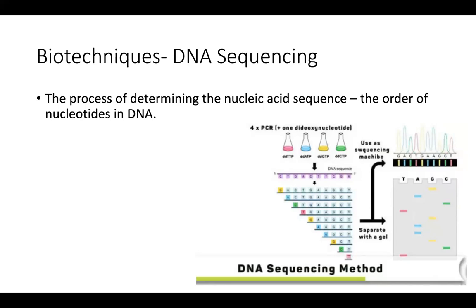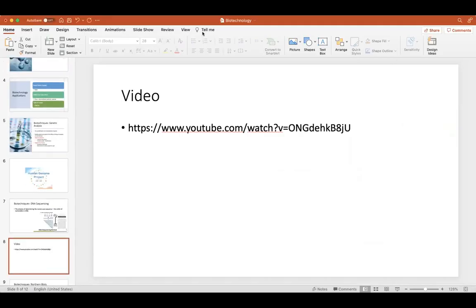Okay. So DNA sequencing is a very important first step in genome analysis. All right. Let's look at this quick video for DNA sequencing.